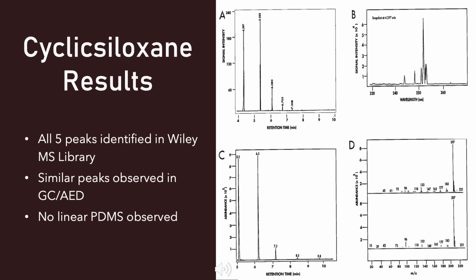They were corresponding to hexamethylcyclotrisiloxane, octamethylcyclotetrasiloxane, decamethylcyclopentasiloxane, dodecamethylcyclohexasiloxane, tetradecamethylcycloheptasiloxane.